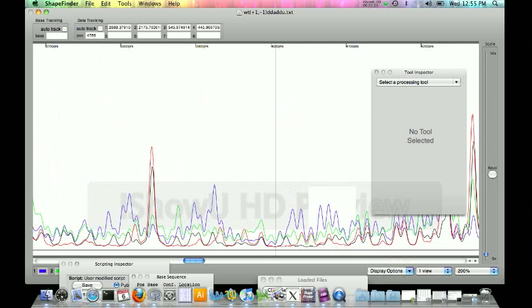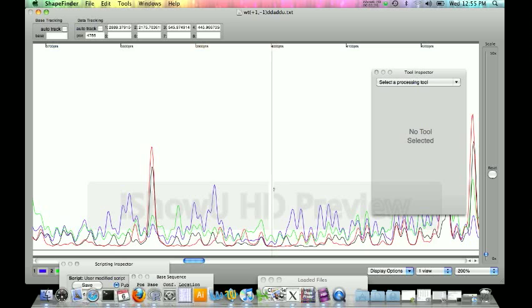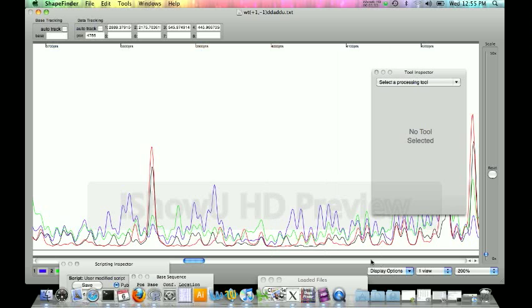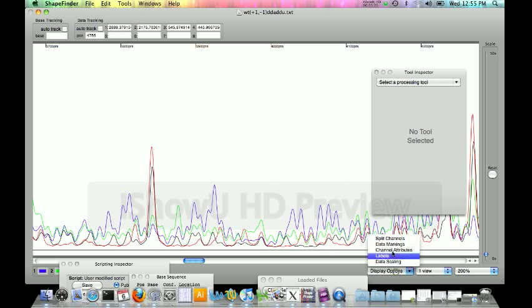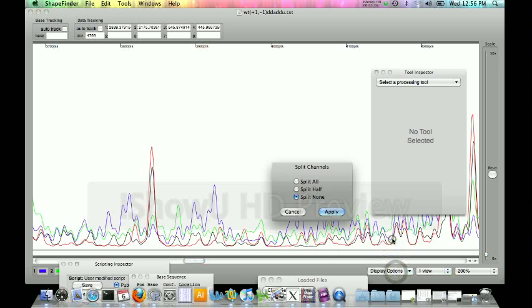This may be helpful if you're trying to visualize four runs of a plus reagent at the same time. With the symbol CEQ, you can choose any four filters you like, and if you chose four plus reagents to compare, you could use this comparison to make sure that they're all reproducible. But right now, we're going through the full ShapeFinder analysis using the ladders, so we're going to keep it split at all four.